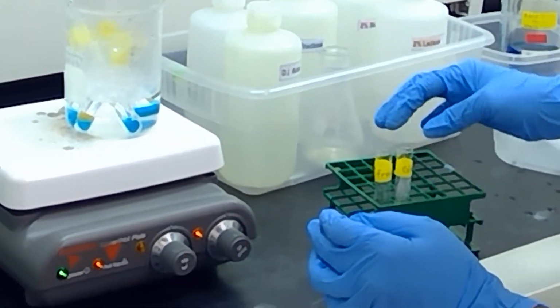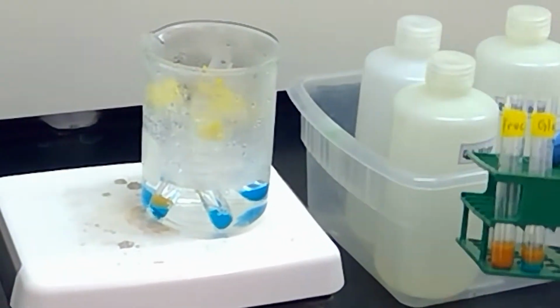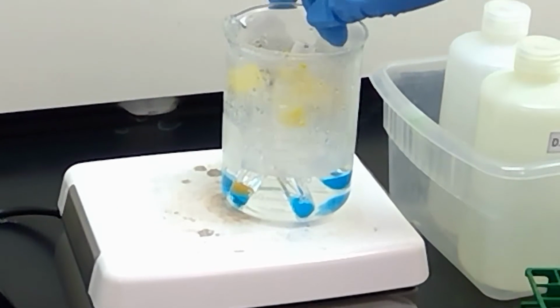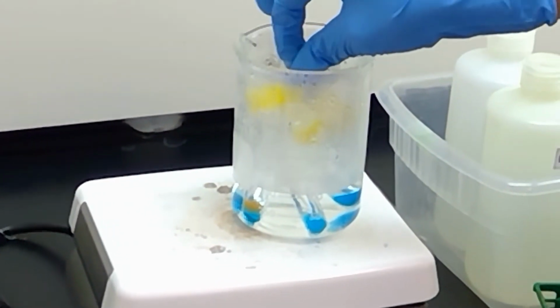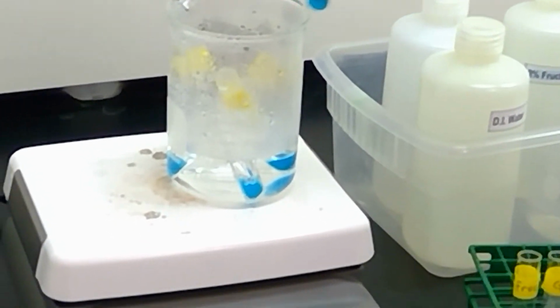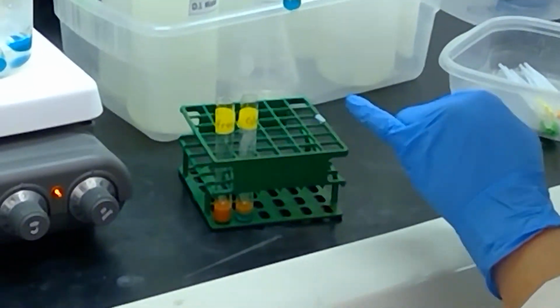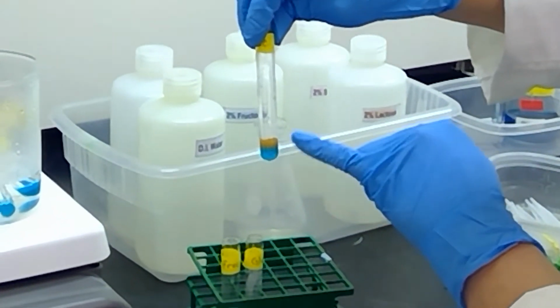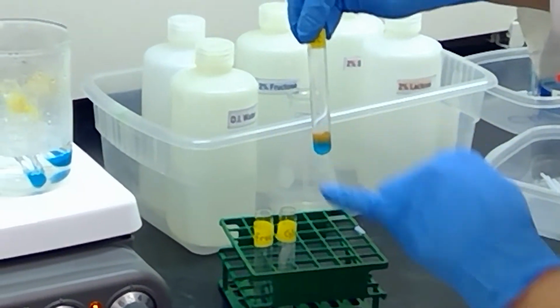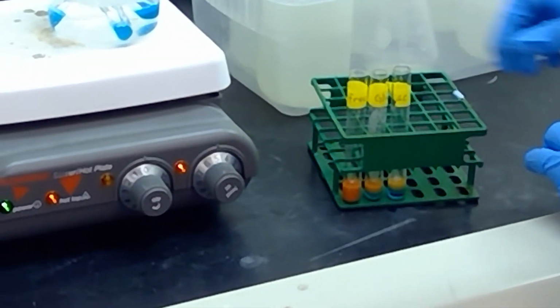Okay, so far we've got fructose and glucose, which have given us the nice, extremely red copper color there. Now let's see, we've got another one in here that looks like we're getting a little bit of color. Which one is this? This is lactose. Okay. Although lactose is a disaccharide, it does have one of the portions of that disaccharide open, which can open up to aldehyde form and cause the reduction to occur. So we would anticipate lactose would be positive.